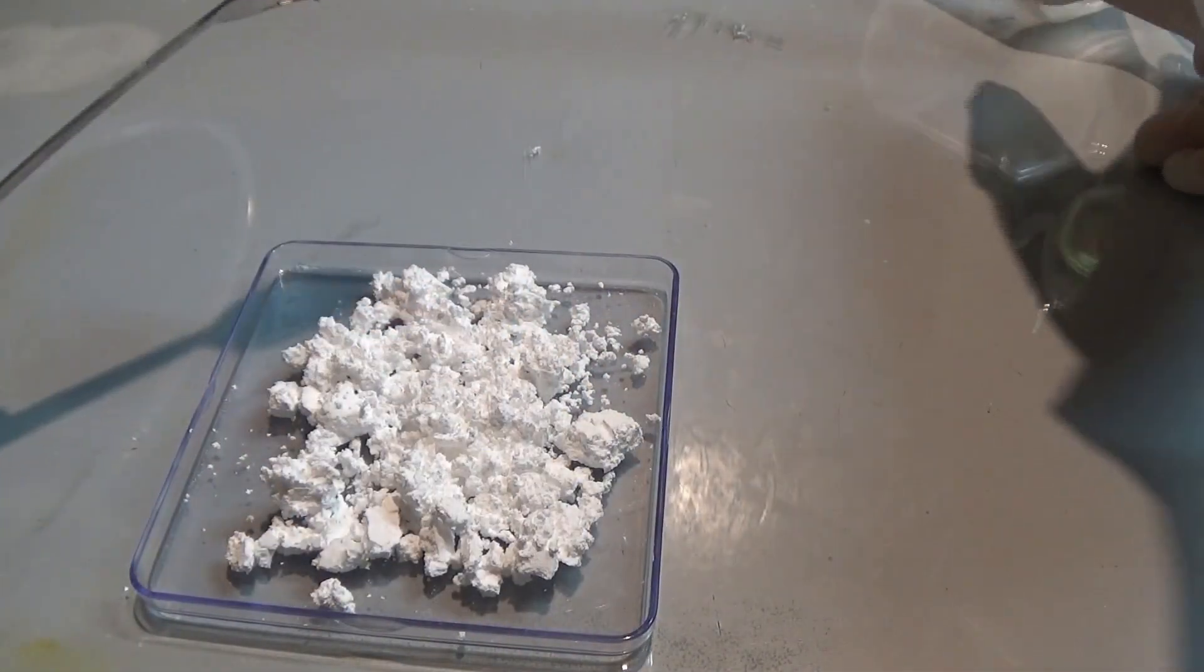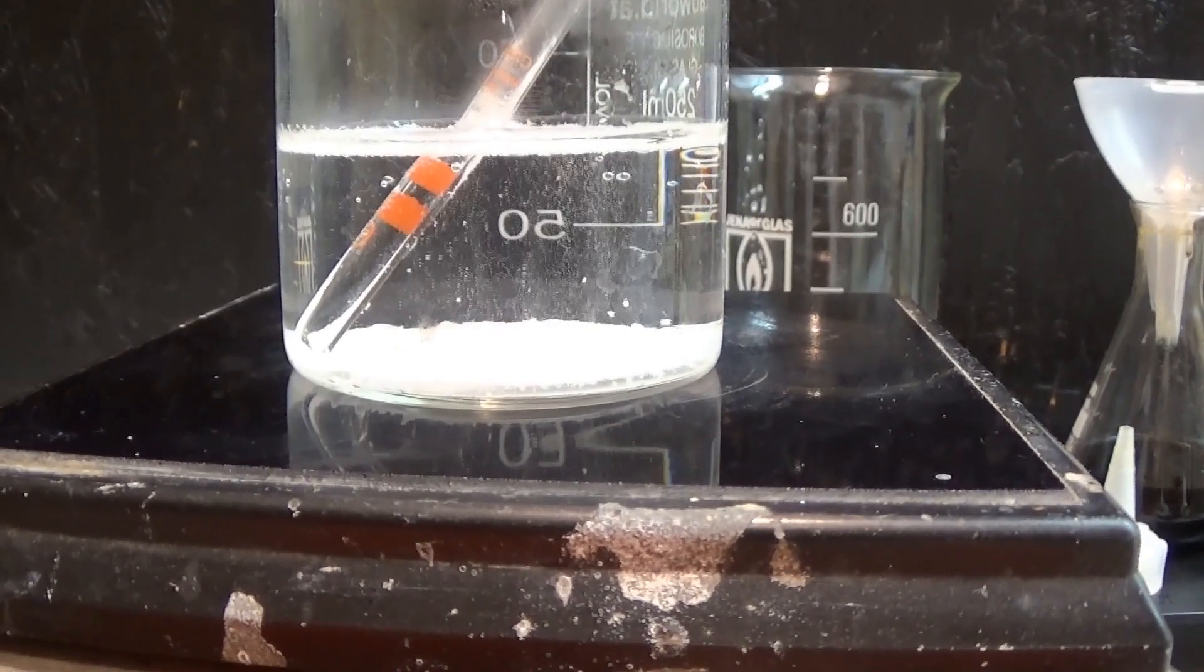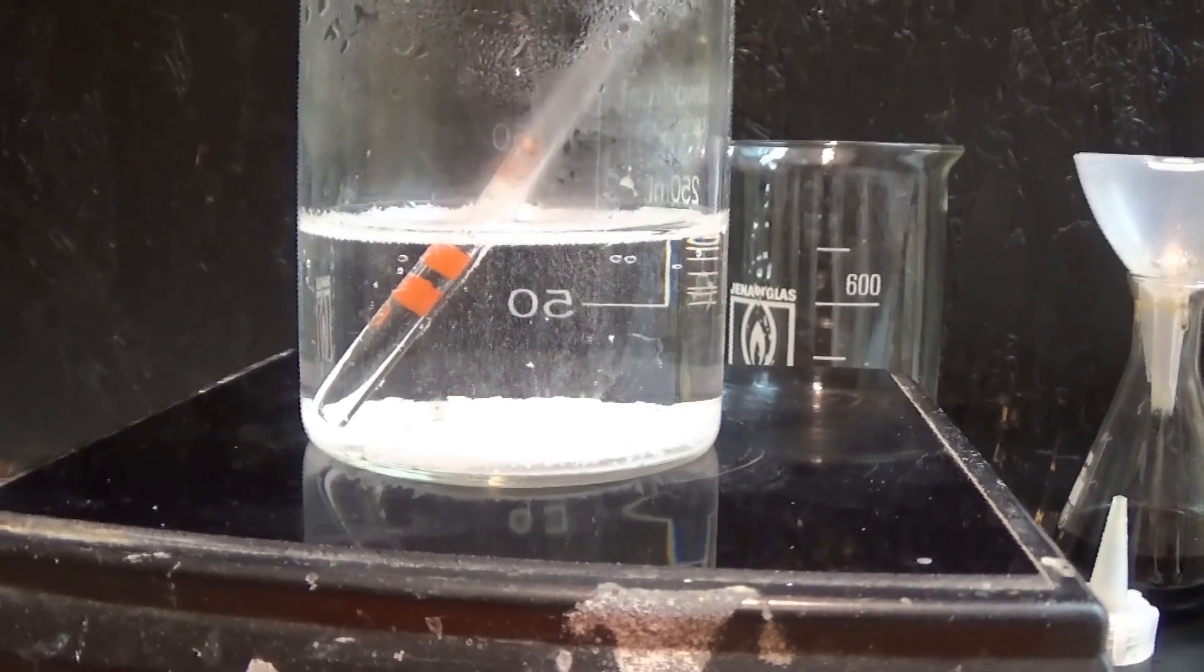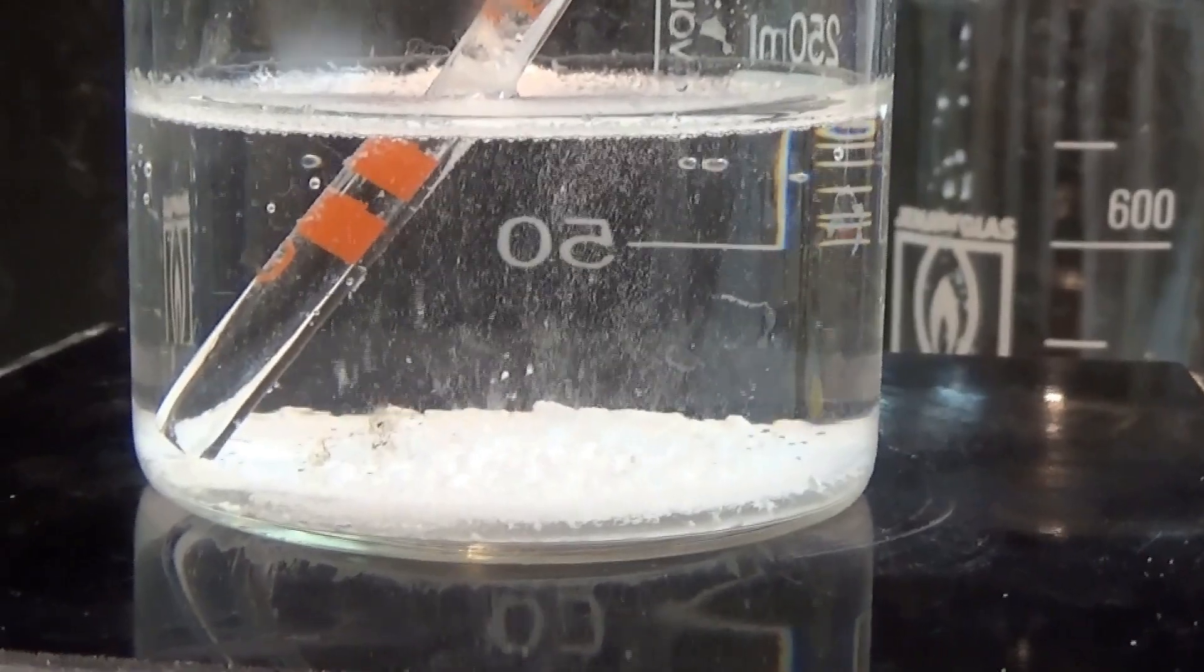So I recrystallized some of the lead chloride so that I could show you the nice crystals it forms when recrystallized from water. Therefore I just threw a bunch of the PbCl2 in water, boiled it, and let it cool in the fridge.